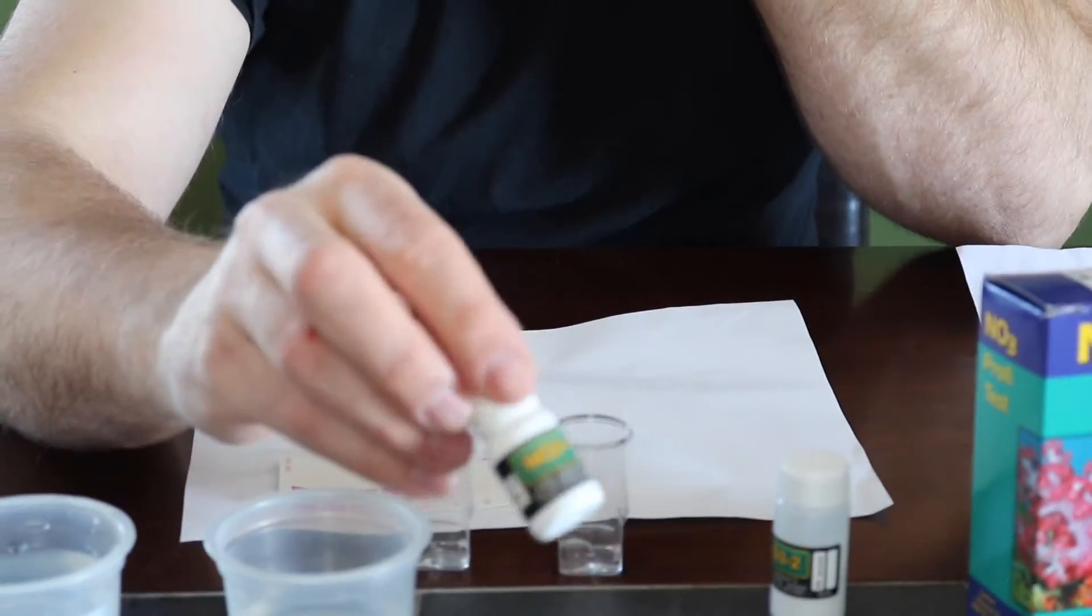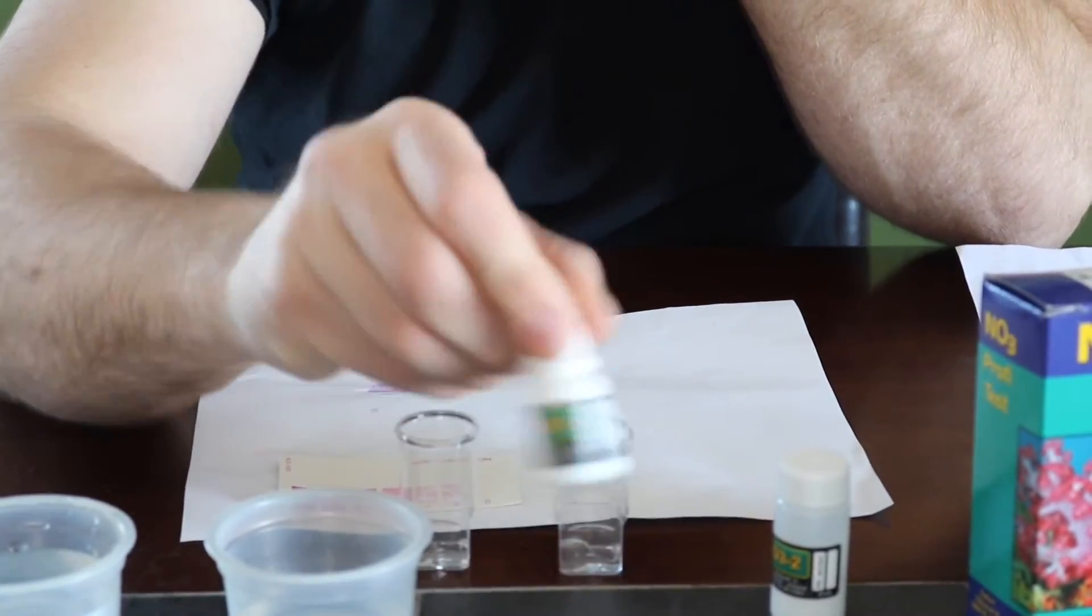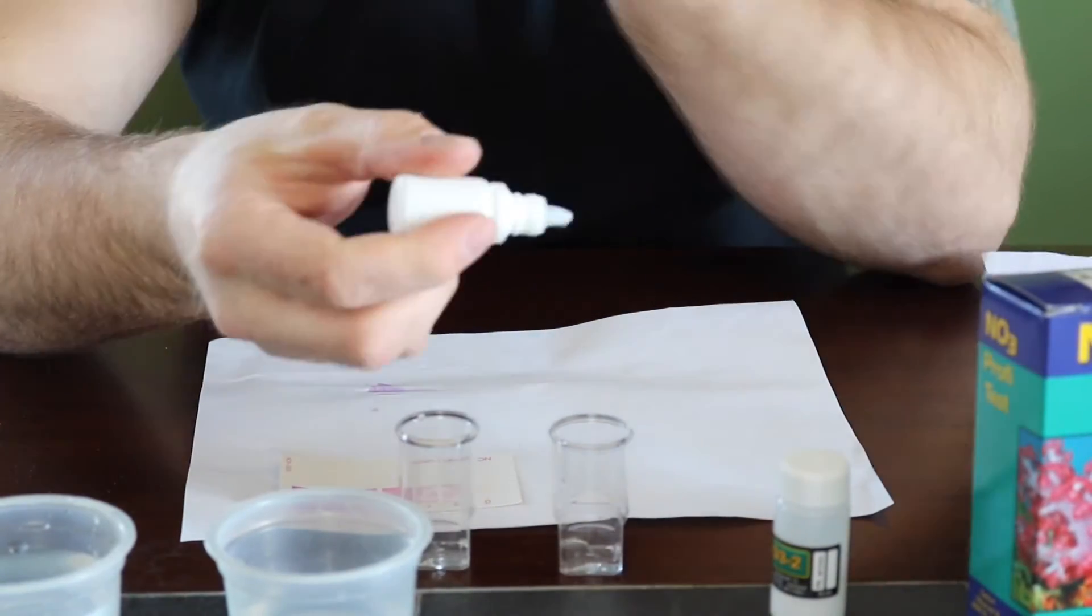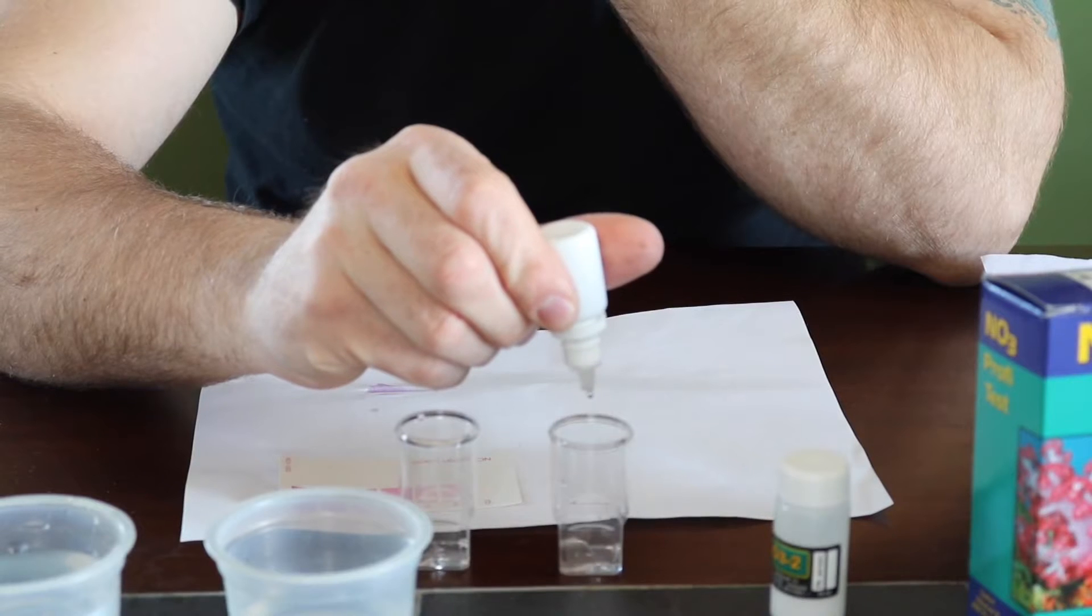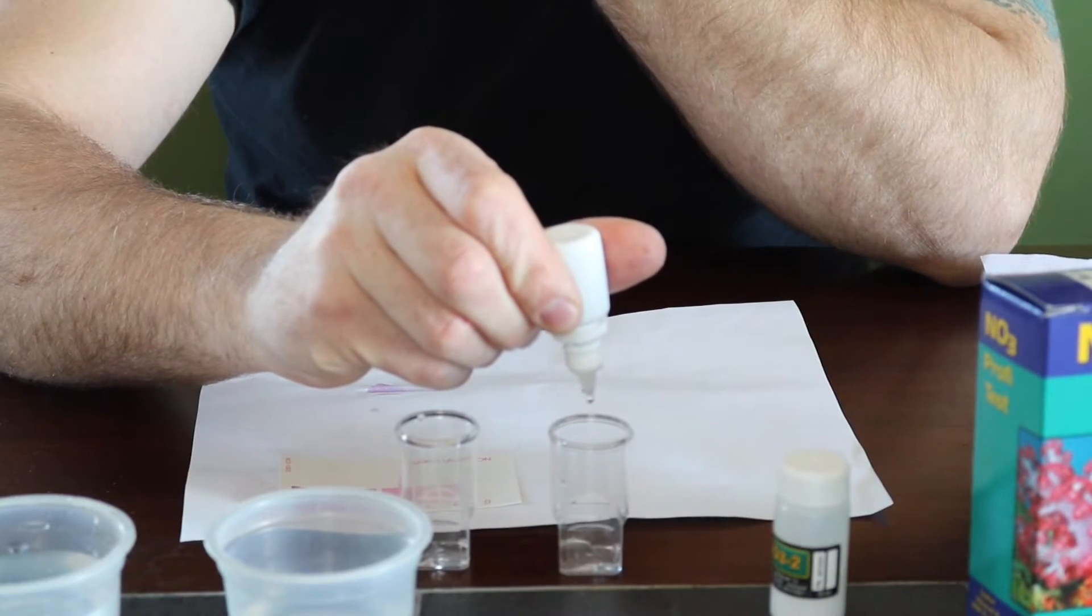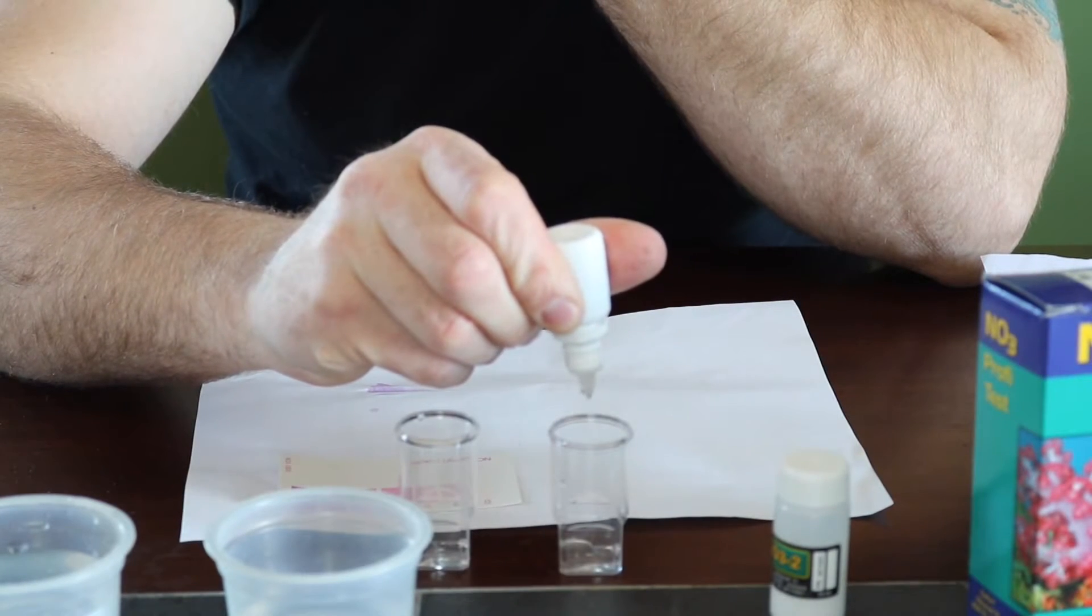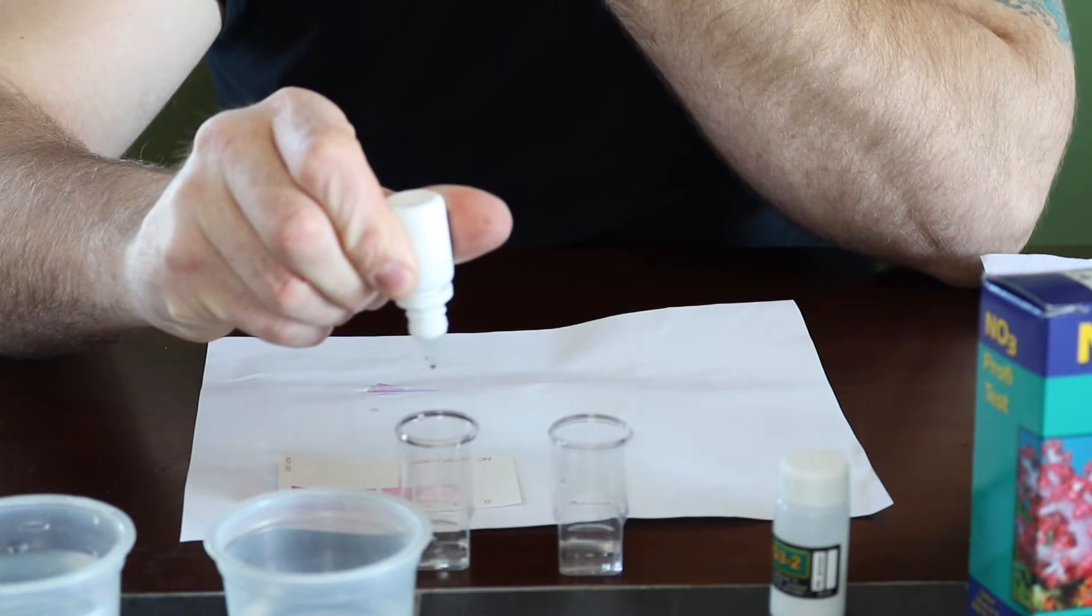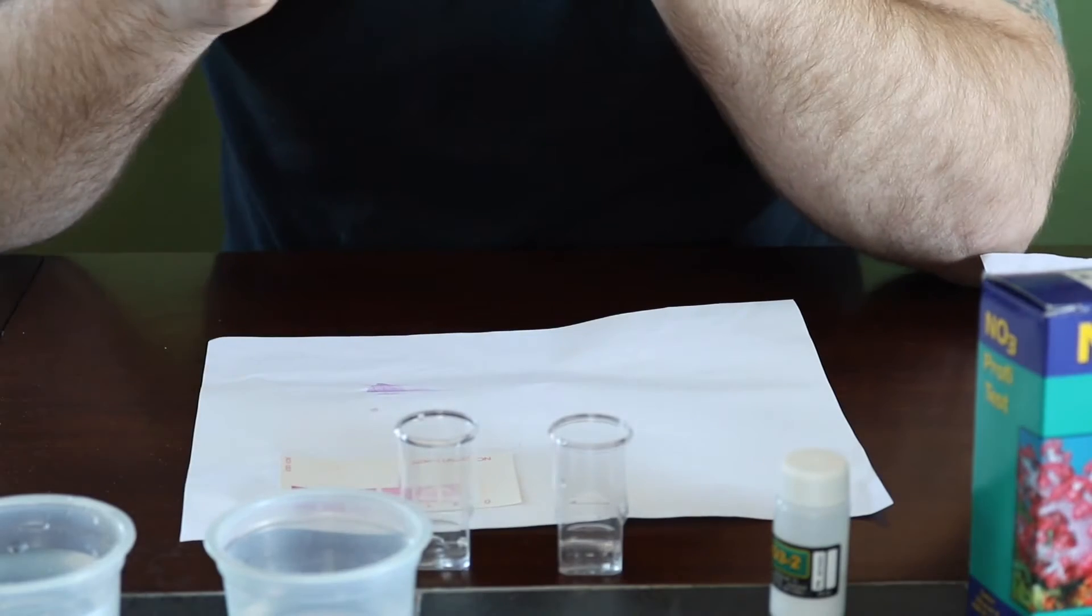So what we need to do now is you need to take your NO3, shake it up a bit. We're going to add four drops per test. So one, two, three, four. One, two, three, four. So we got that in.